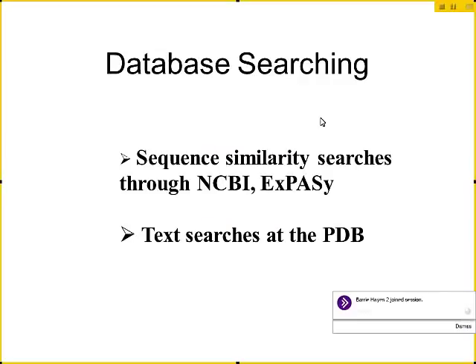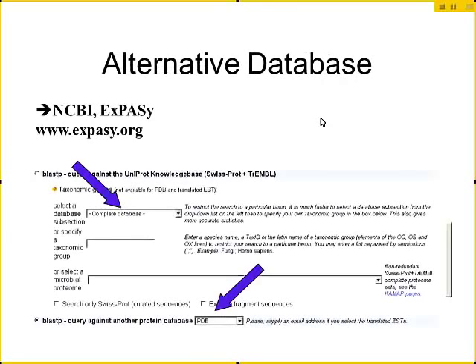The question becomes: how do I search the protein databank to find structures of my protein? I'm going to mention two-way sequence similarity searches — I'm not going to spend a lot of time on that — and you can also do text searches by going to the RCSB website and searching for the name of your molecule. But the way that I use almost all the time is sequence similarity.